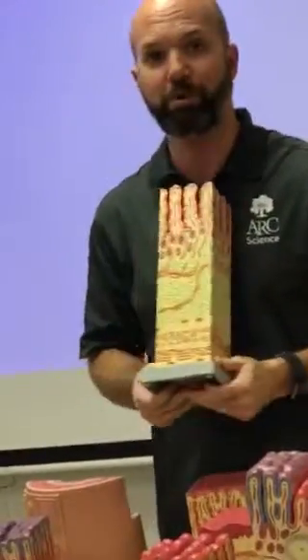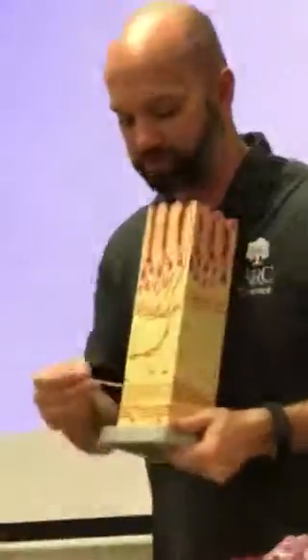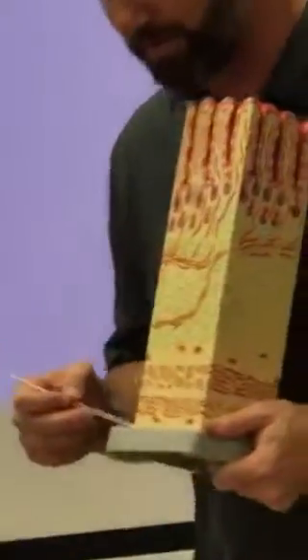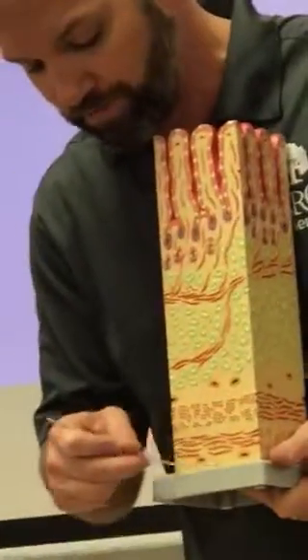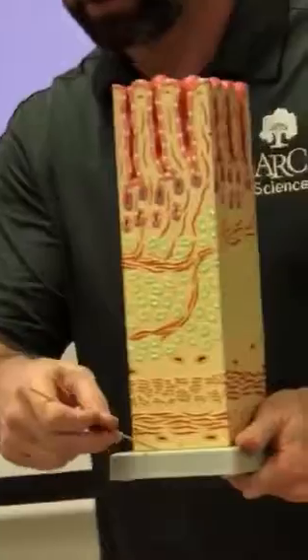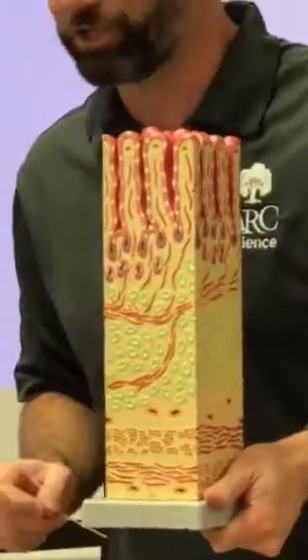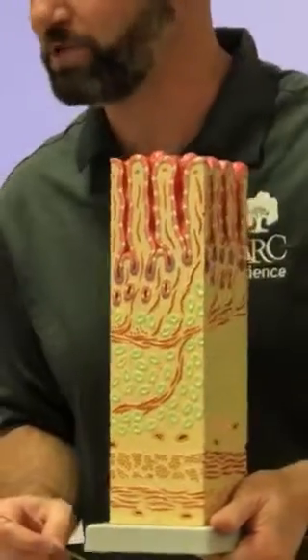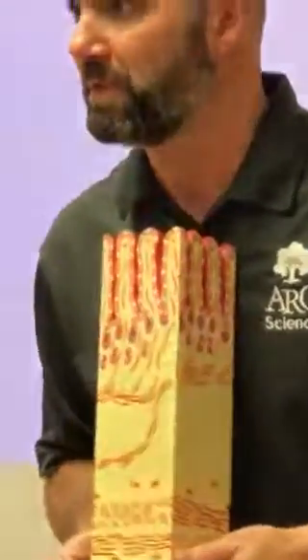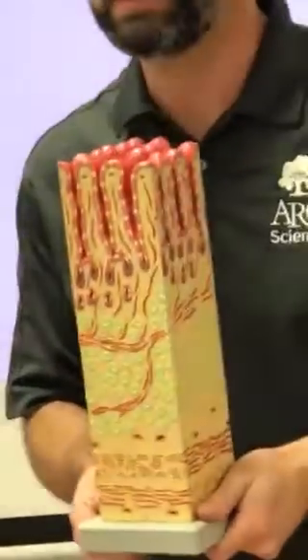Then you've got to figure out what part of the small intestine. There's a few things you could look for. You might just go straight to the bottom of the model. Look for that outermost tunic. I don't see a simple squamous epithelium here. I only see connective tissue at the bottom. So that means the outermost tunic is adventitia. What part of the small intestine has adventitia? Only the duodenum.